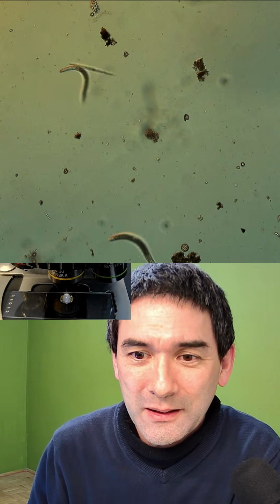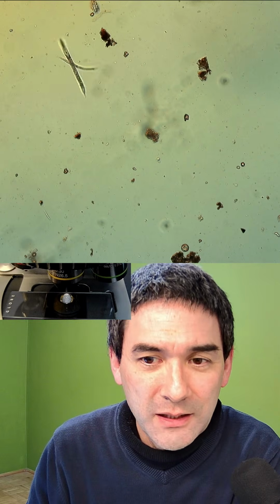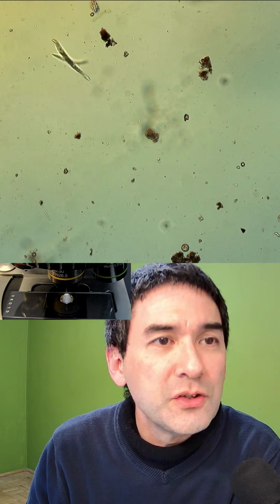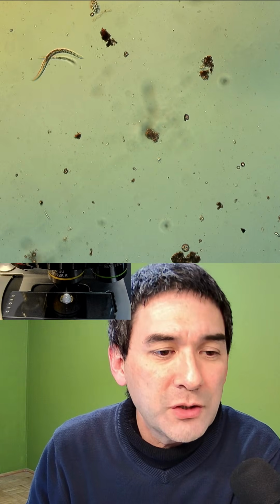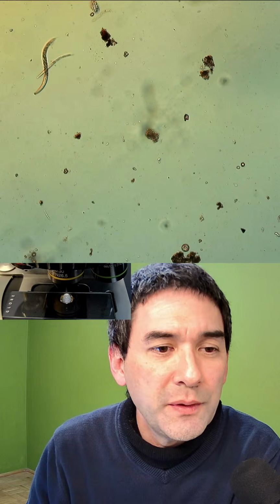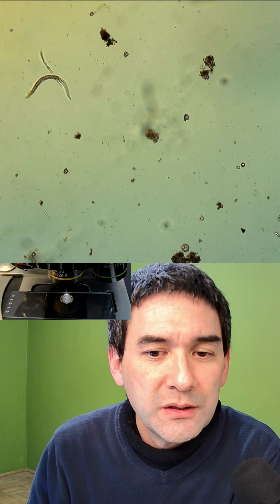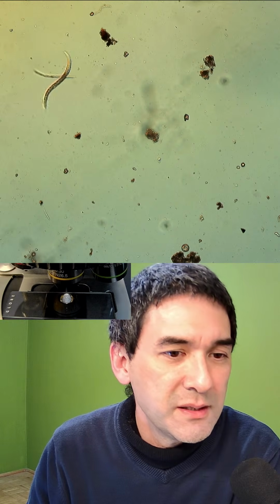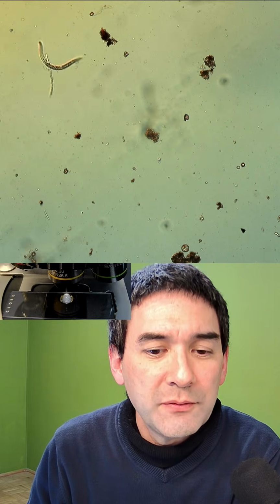So that's the thing. There's an interesting comment here. Just a second. I'm also switching back and forth on whether I'm able to see that the vertical one works. Yes, it still works. That's also always something that I have to check.